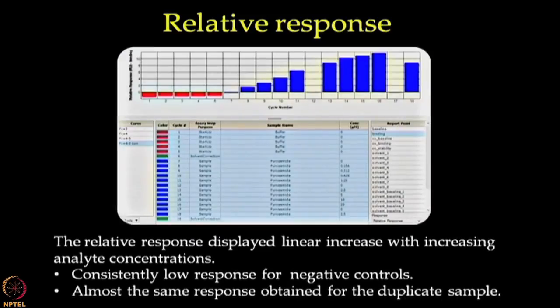Before starting with the data analysis on kinetics of the interaction between carbonic anhydrase and furosemide, we would like to show the bar graph obtained from the sensorgram which represents the relative response for report point binding against cycle number for samples. As reflected in the graph, the relative response displayed linear increase with increasing analyte concentration with consistently low response for negative controls shown by cycle 7, 12 and 17, and almost the same response was obtained for duplicate sample, 2.5 micromolar, shown by cycle 13 and 18.